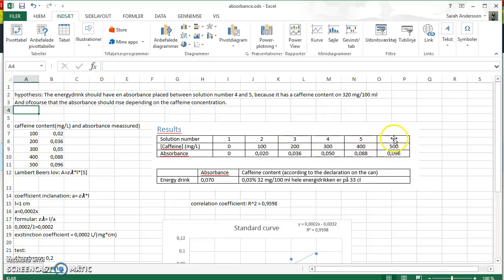Then we transferred 1 milliliter of energy drink into the microtube marked E, and then we added 0.200 milliliters of 0.050 molar iodine solution and 0.20 milliliters of 2 molar sulfuric acid to each of the 7 microtubes and mixed it well.